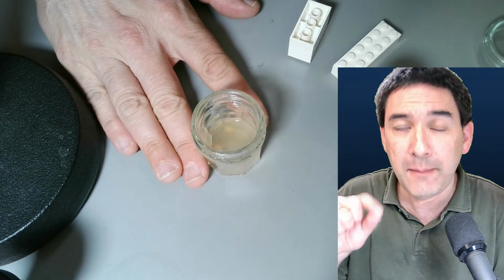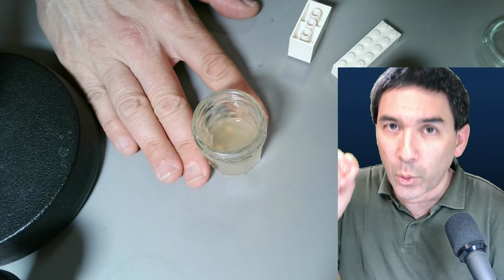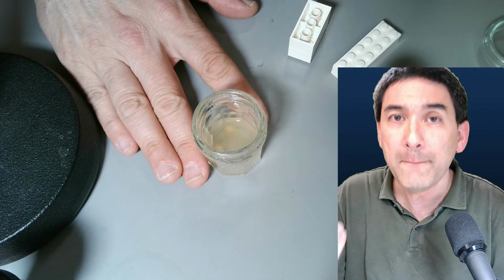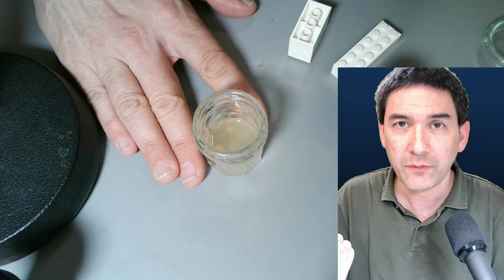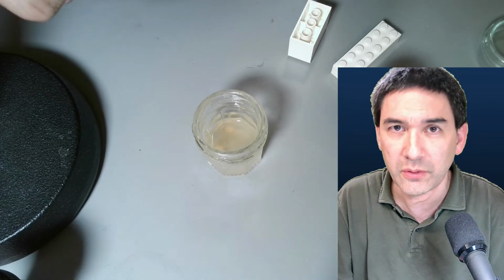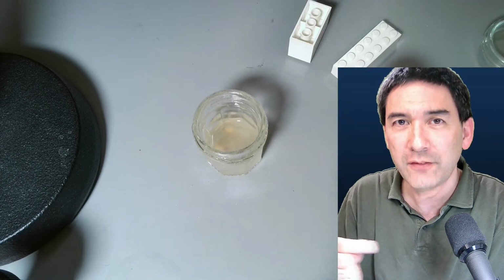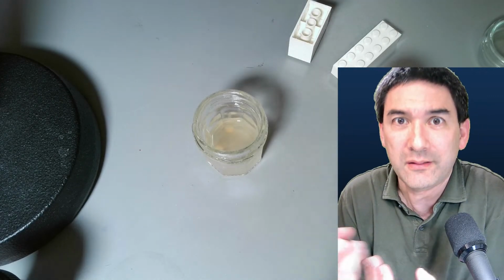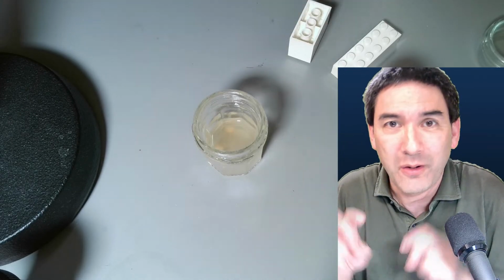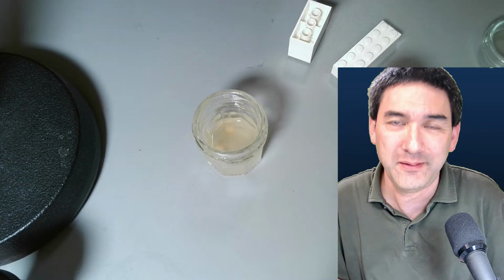However, I also have to say the following. This here is a pond water sample. I would be more concerned, for example, if I were to decompose meat. If I take some meat and add some, I would be a little bit more concerned, because those bacteria actually have the possibility to live on meat, on animals, right? And humans are animals, right? But these are, in quotation marks, only water bacteria.